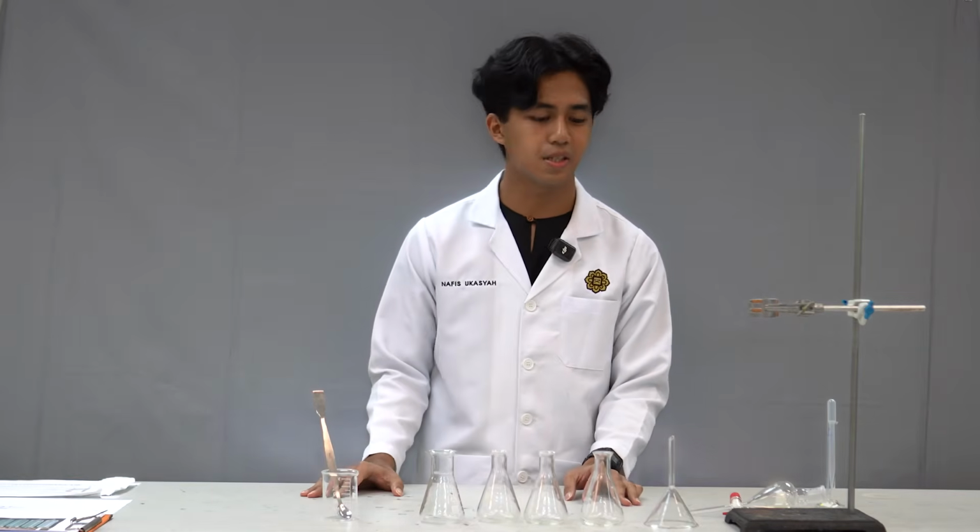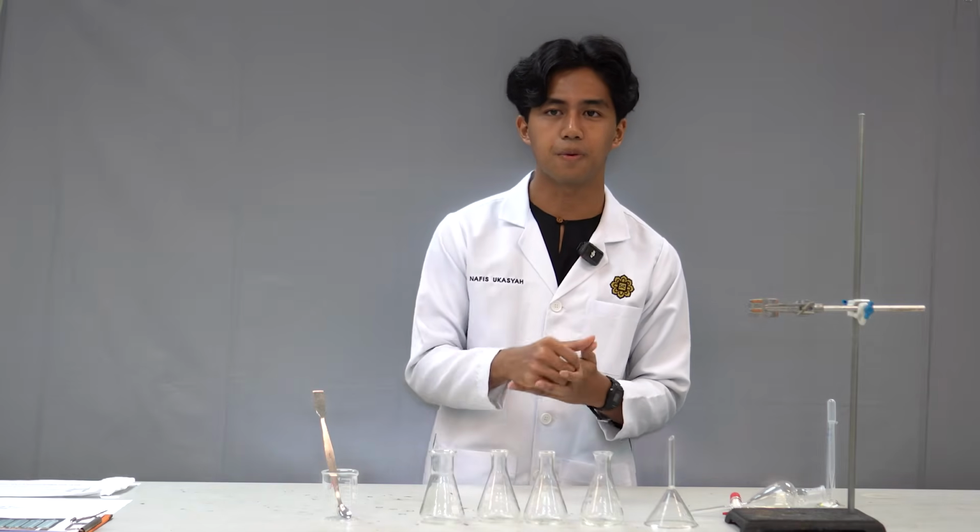Alright, Bismillahirrahmanirrahim. So I will continue what has been discussed by Brother Hazami and Brother Amer. Actually, this is an experiment of liquid extraction, and the main purpose of this experiment is to demonstrate the acid and base reaction that can be used to separate different compounds.